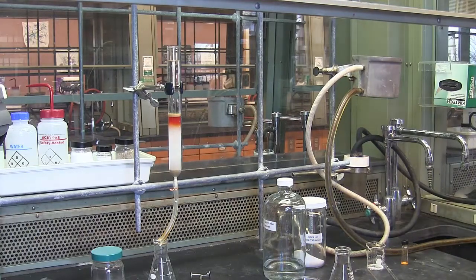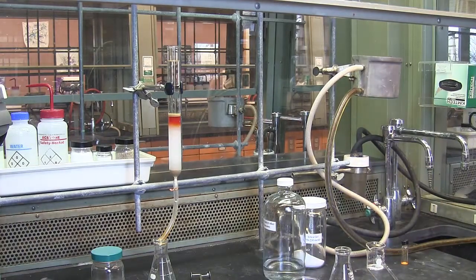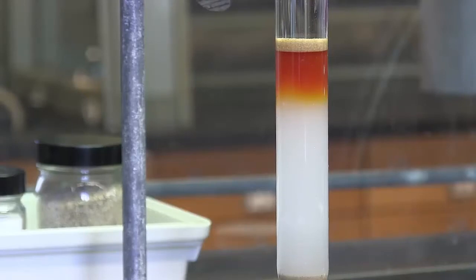I can already see separation in the column. Zooming in on the top of the column, you can see that a yellow band is moving more quickly through the column than the other components. Looks like there's some orange behind the yellow and some deep red at the top of the column.